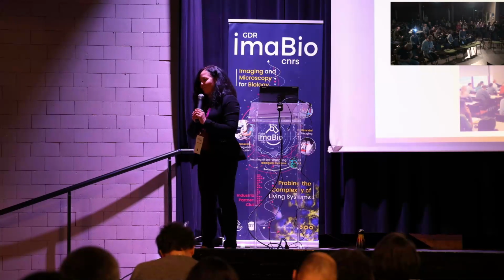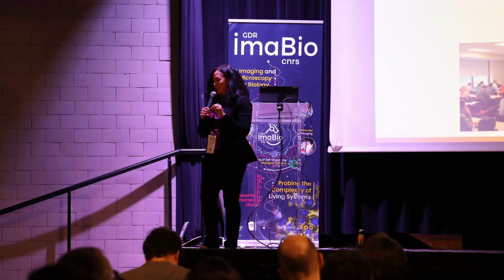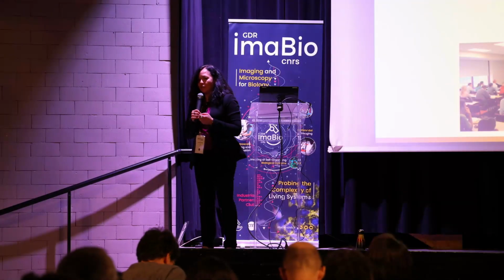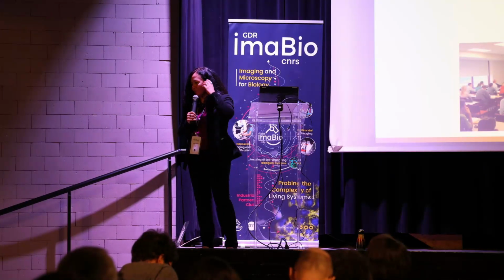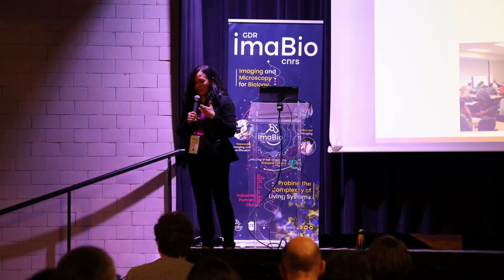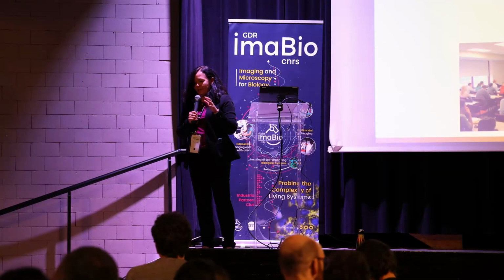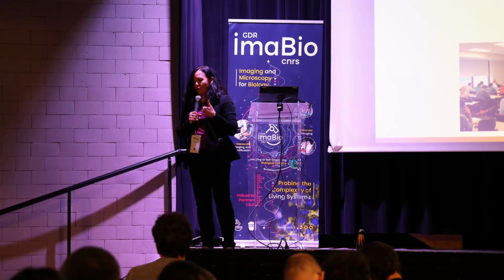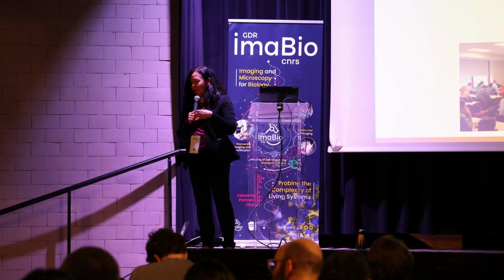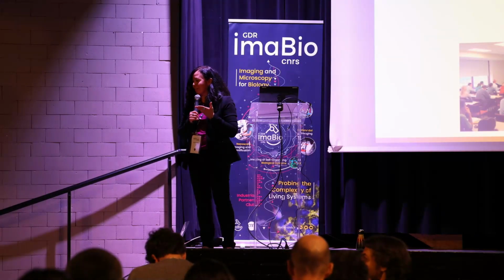Excellent question. And one thing I didn't mention is that the reactive oxygen species is interacting with lipids. So it's oxidized lipid signatures that we're actually obtaining. And this was confirmed by one of Enrico's former students, Rup Sadatta, where they looked at the accumulation of adipose tissue, and they fed fatty acids to the tissue. And they saw the production, first the reactive oxygen species occurred, and then the oxidized lipid signature increase, and that was confirmed by CARS imaging.